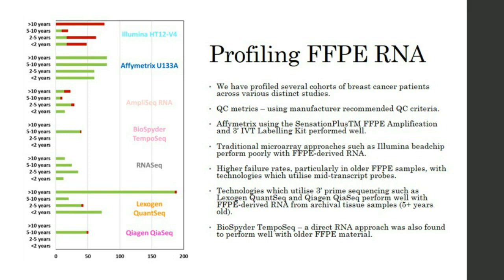We've performed a number of studies with Lexogen QuantSeq, including over 180 samples which are more than 10 years old, and successfully generated reliable and usable transcriptomic data from those, which has been fantastic. Again, QIAseq is another 3' technology, which again we've performed a small number of samples with, about 50, and again the results were promising.